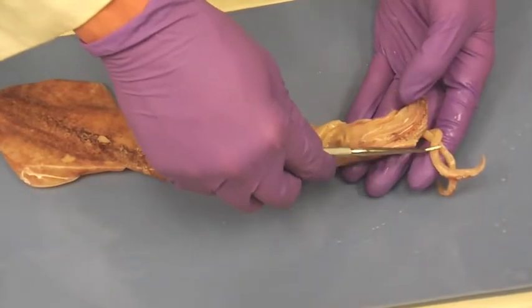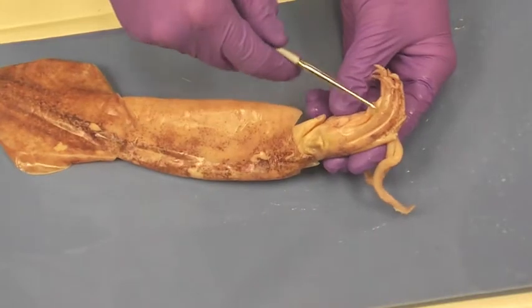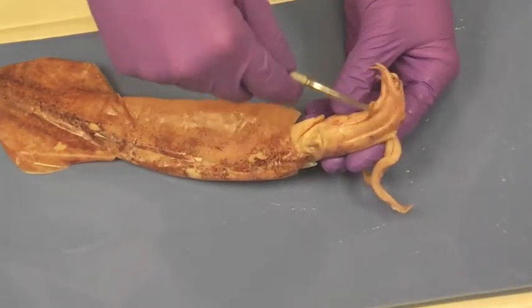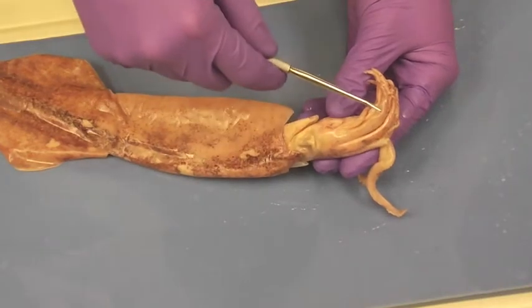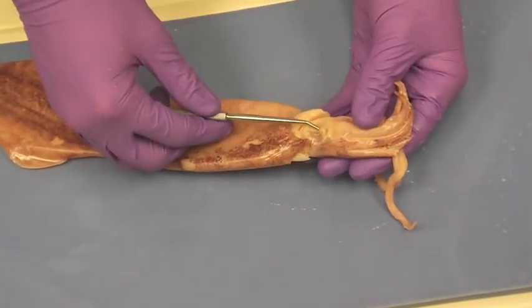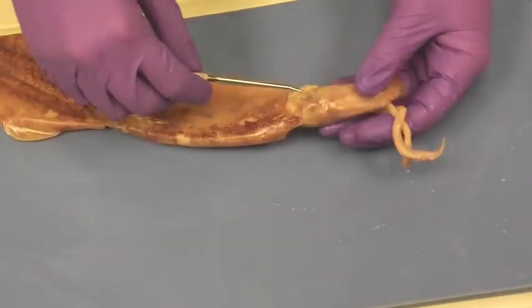Those are the tentacles of the squid. These are the arms of the squid. You can also see the little suckers on them. That's your eye. You can kind of see a little purple darkness in there. That's the eye.